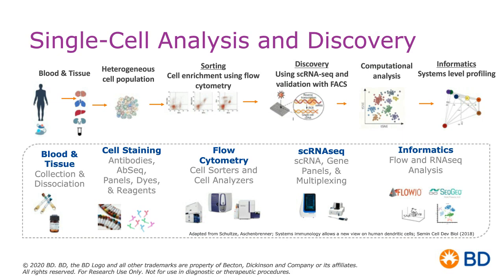And not that those specialists are no longer needed, because they certainly are, but we often find ourselves in a place where we want to just take a look at our data. We want to understand, do we want to move forward with the data that we acquired? Can we take an initial look at it and understand maybe what populations are present and do some exploration and discovery ourselves?